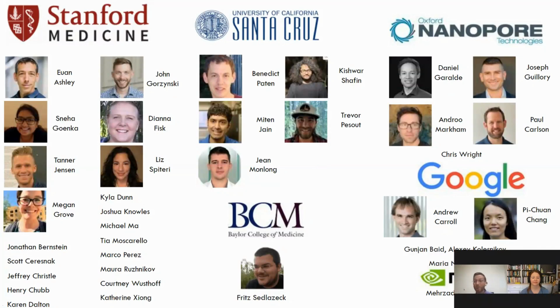And I think we're really just waiting at this point for the technology to be good enough for us to do this on the nanopore sequencing platform. And I expect within the next year we'll see methods of this. With that said, we have other sequencing platforms like 10x Genomics that can do single cell sequencing. That's quite good. But in terms of a long read sequencing platform, I think Nanopore is going to come out with it very, very shortly.